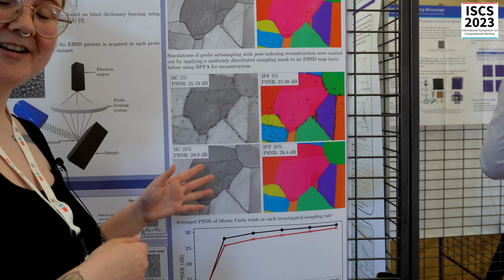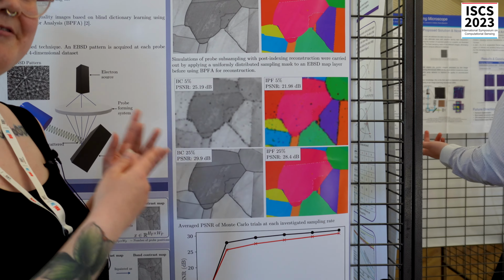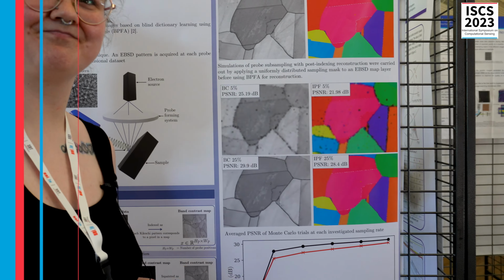However, at 25%, you can see we've got a really good reconstruction, so they're very similar to our fully sampled data set, and essentially give us everything that we need.